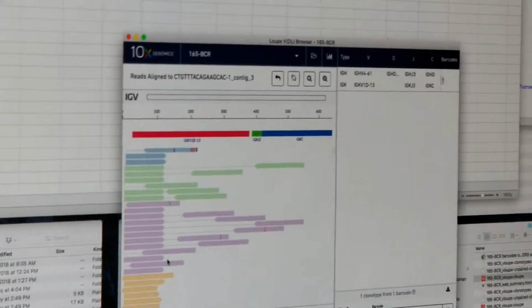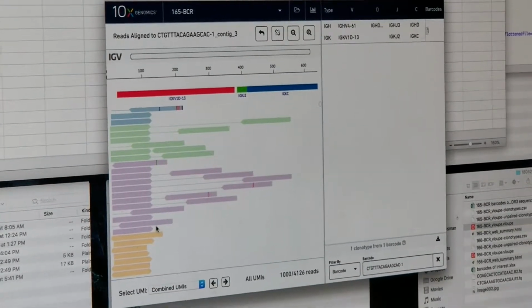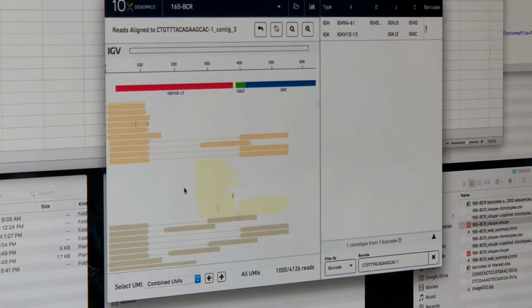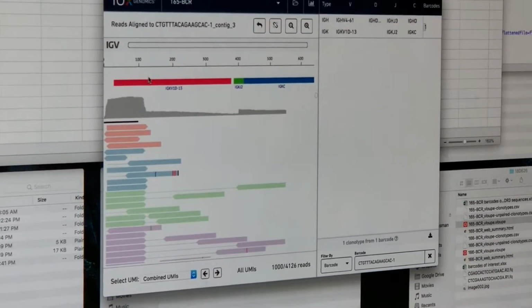But like here, you have a little mutation, this little green mutation, but I don't see it in any of the other reads here, so I don't believe that it's real. I really don't see it in anything else either. Is it listed in any particular order, like fidelity or quality? No. So most of this is already good quality alignments.